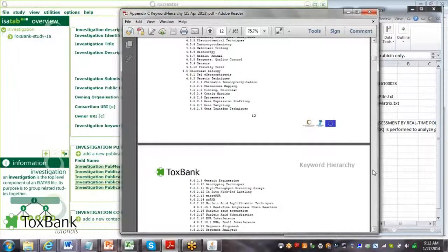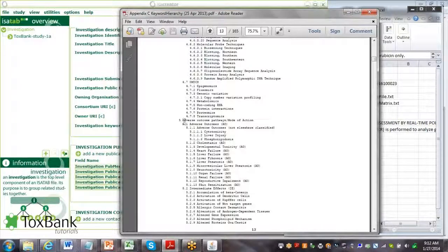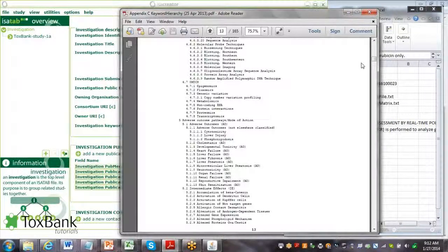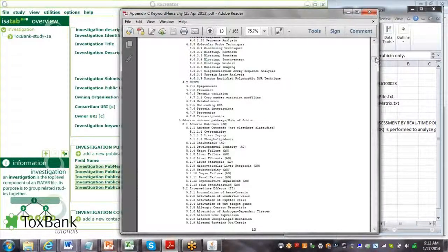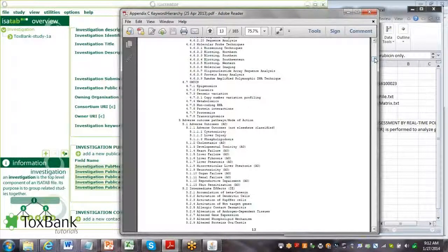And then finally, the keywords talk about adverse outcome pathways or mode of actions. Generally, in an investigation, you may have keywords from each of those elements.